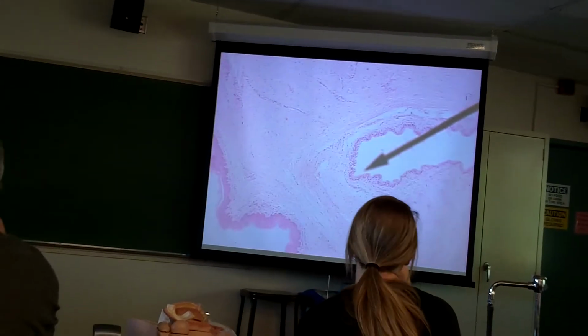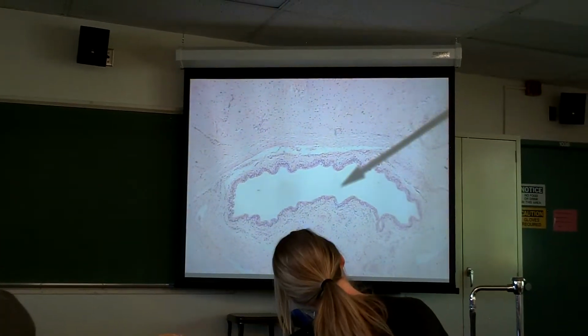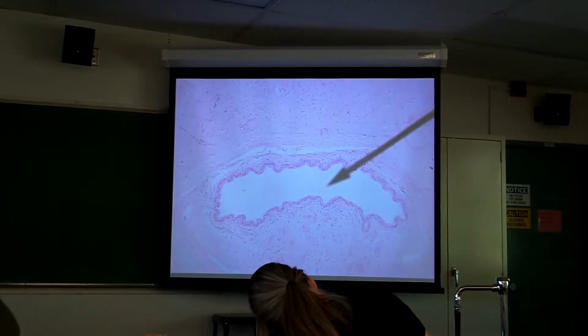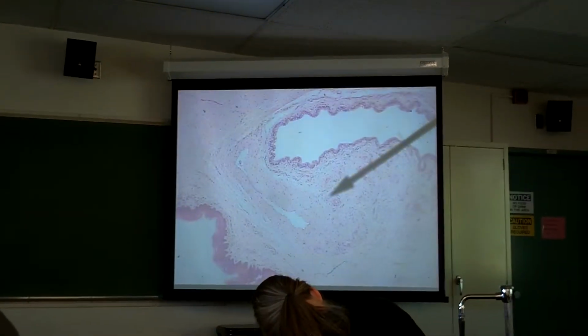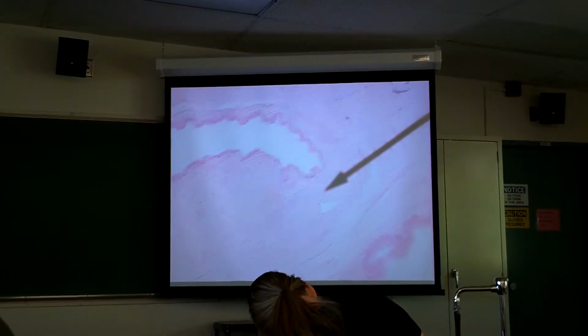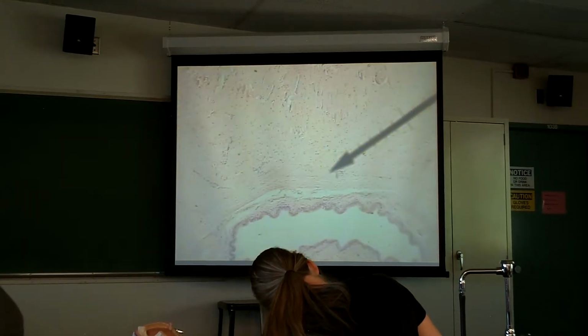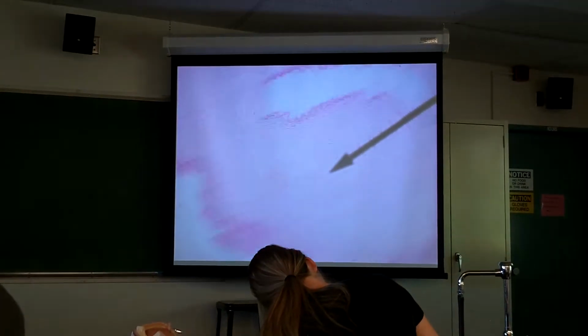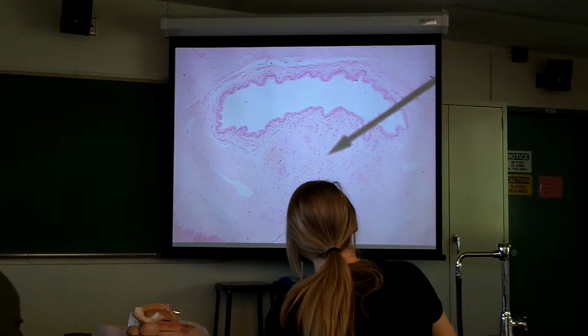And then let's look for the urethra. There it is. Notice again the irregular shape to the urethra, and it's lined by a nice purple epithelium. That means that this is erectile tissue around it. See how there's lots of white space, lots of little open chambers for the blood to flow into? That's one reason that you can tell that it's erectile tissue. So if we did something like this on the test, corpus spongiosum would be the best answer versus urethra.